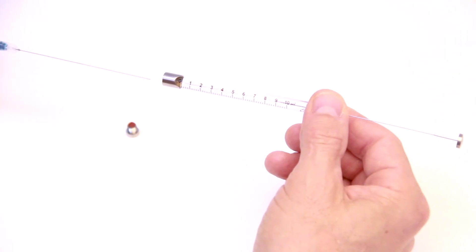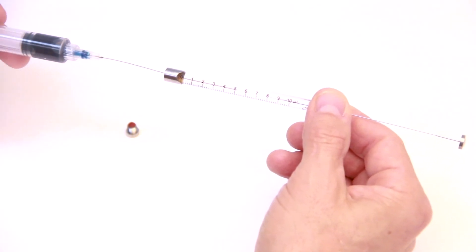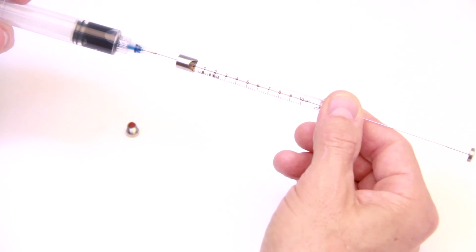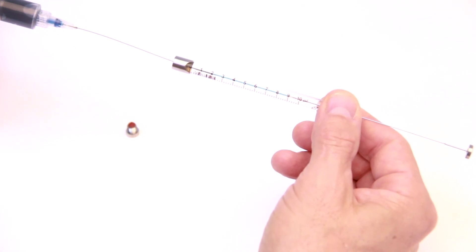Then insert the MicroFil into the syringe through the front, and as you are injecting fluid you just pull back on the MicroFil. And there you have it.